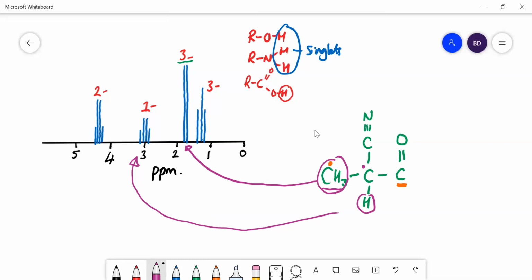Now we've got 4 of our carbons there. We've only got to worry about 2 other carbons. There's 6 carbons in this molecule. What strikes me next, I'm going to do this in yellow, is that we have a triplet with an integrated value of 3 and a quartet with an integrated value of 2. That is very characteristic of an ethyl group.